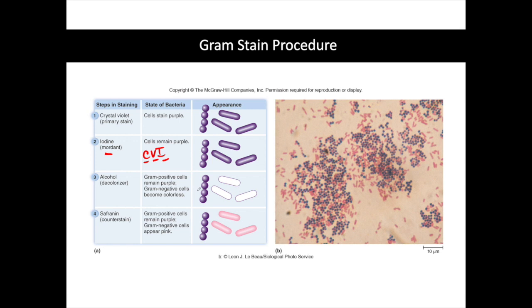In order to see our gram-negative cells, we now counterstain with a lighter dye called safranin. And safranin causes our clear cells to become this pinkish red, and it just intensifies the dark purple color of the gram-positive cells. So that when we're done, we should see something like this slide over here, where we have gram-negative cells here, and these purple dots here are gram-positive.